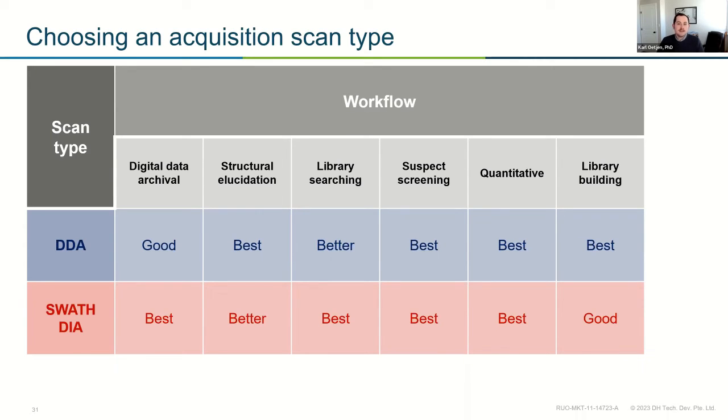We collected that data using SWATH, and it lived on a hard drive for 4 or 5 years. Then a graduate student came in and had a different question. She was asking, what hydrocarbon surfactants are present in those kinds of solutions? Because we collected the data using this data-independent acquisition approach, she was able to go through, create a suspect list of hydrocarbon surfactants, and identify if they're there. So that can be really powerful.